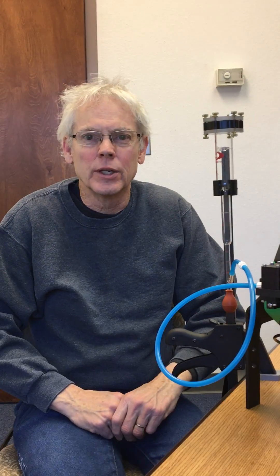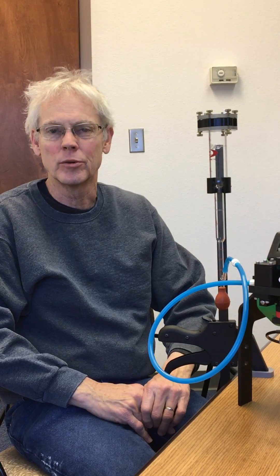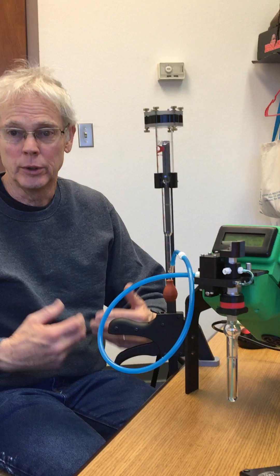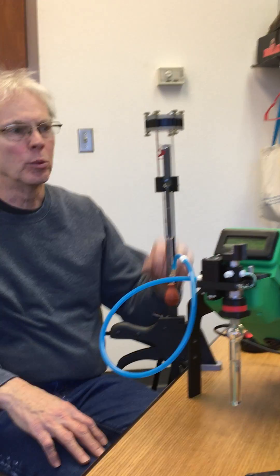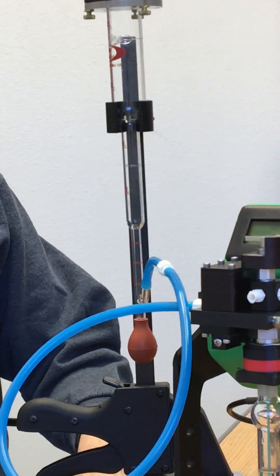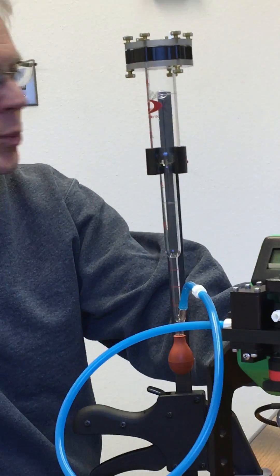Hi, I'm Doug Adkins at Defiant Technologies. Defiant sells gas chromatography equipment, and with any GC system it's important to be able to measure your flow rates. Defiant now has a bubble flow meter available that will help you do just that, and I've got it set up here on one of our Frog 5000 systems.